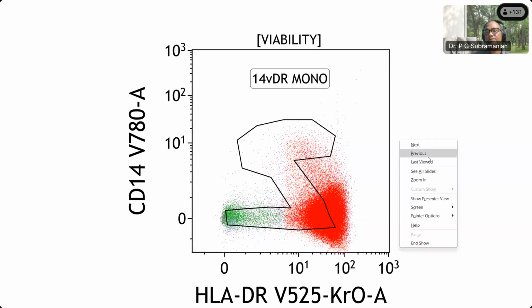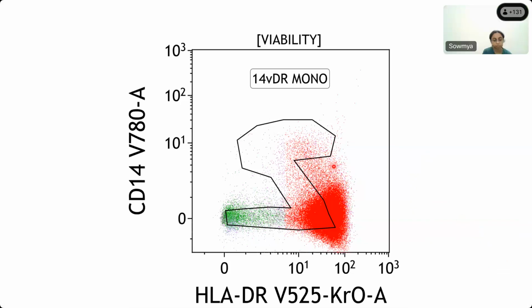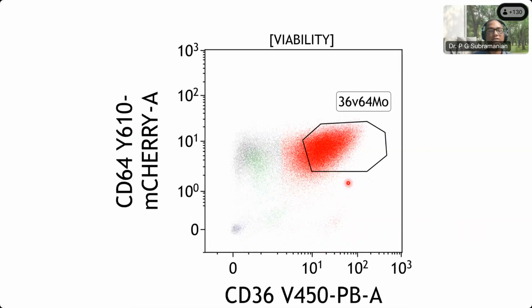So this is the way normal monocyte maturation pattern is there, so it is not exactly like a normal maturation. And those blasts are also positive for CD36. So the 36-64 combination is more likely to be a monocytic lineage, as I had shown in the previous table.